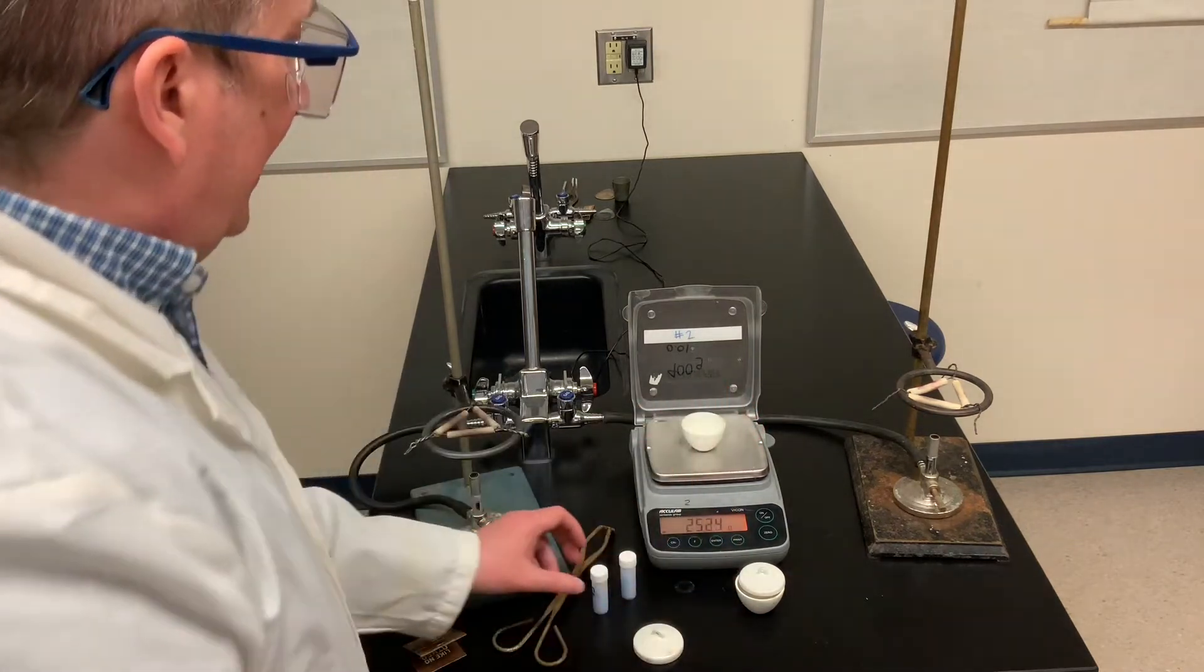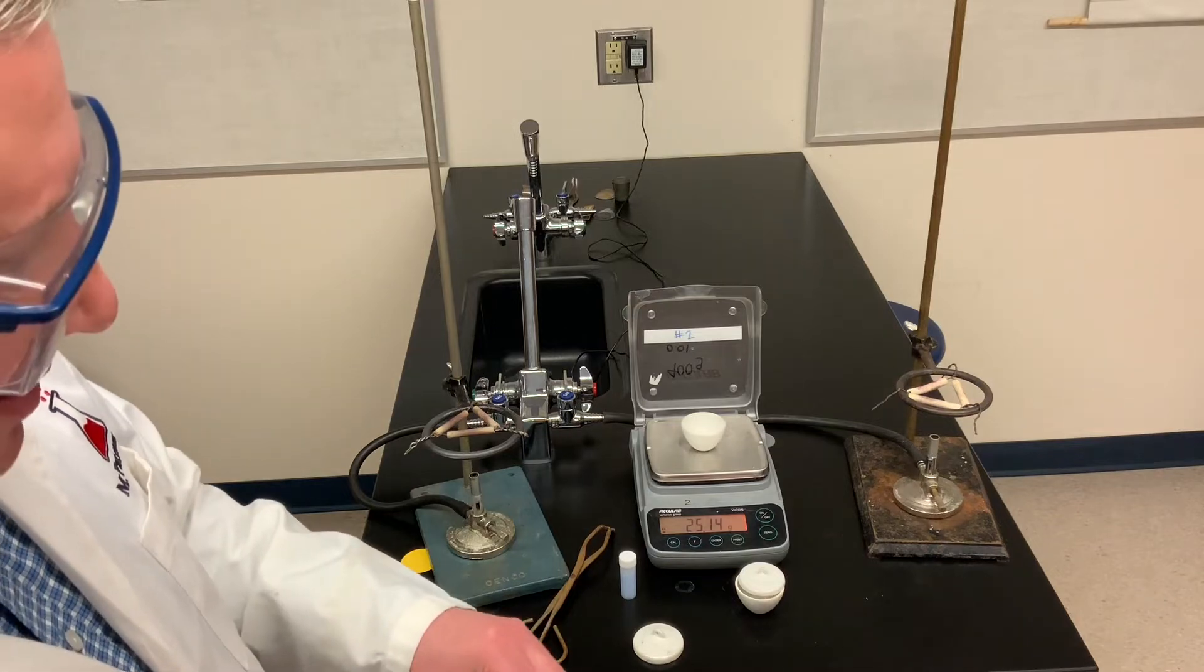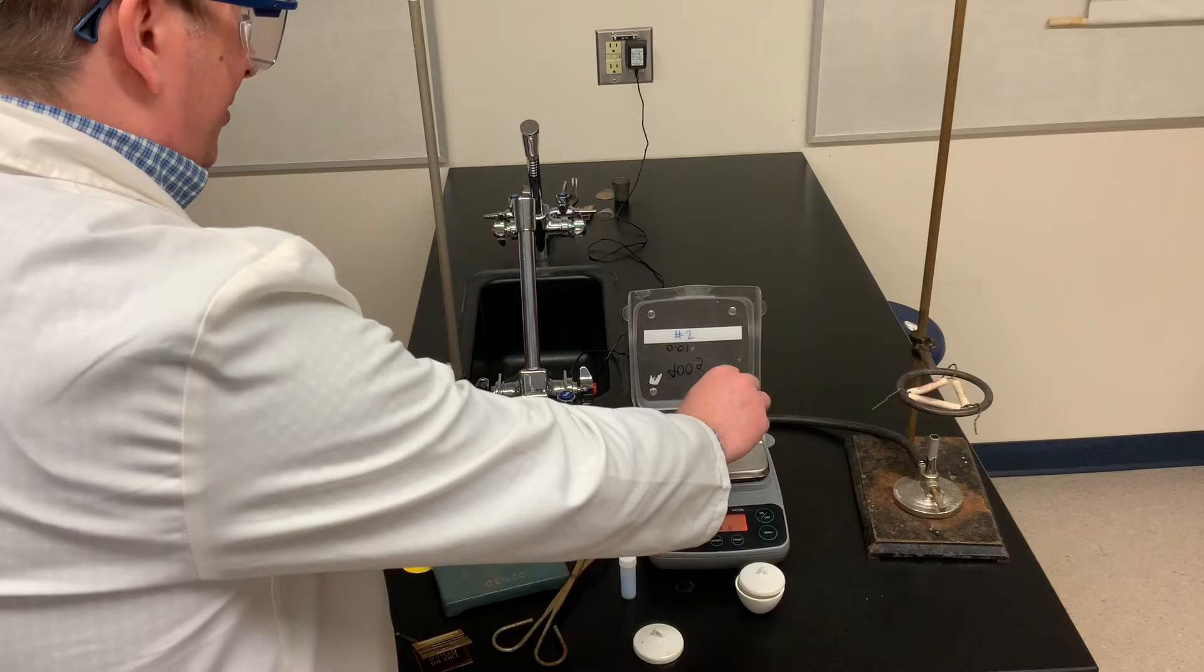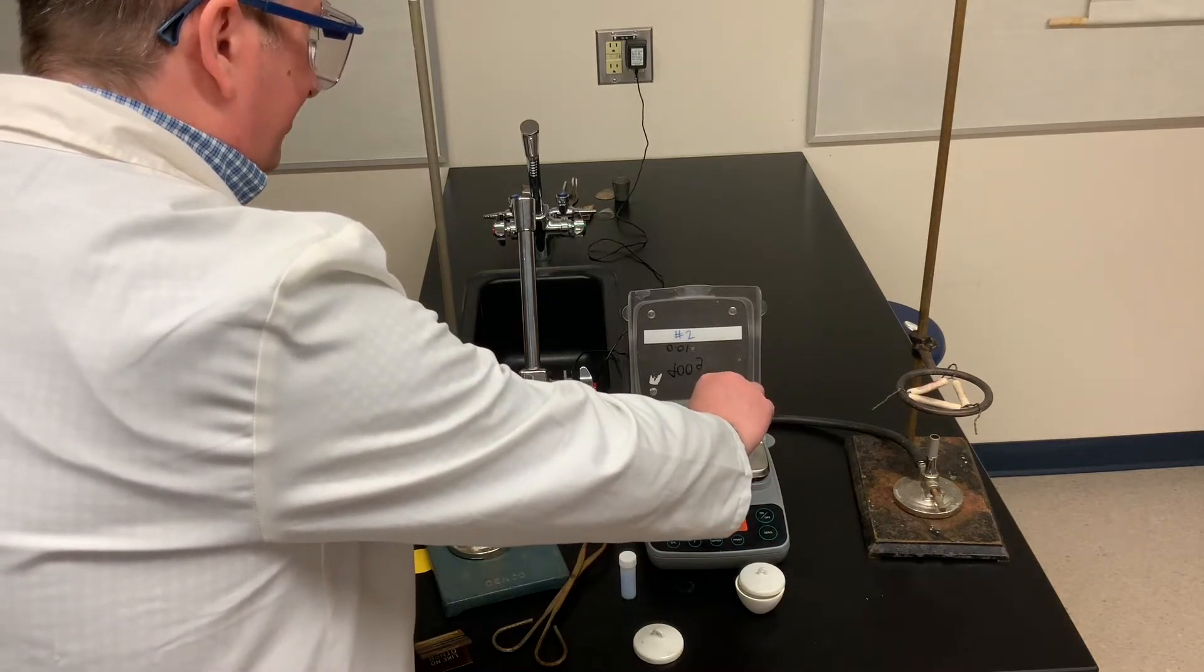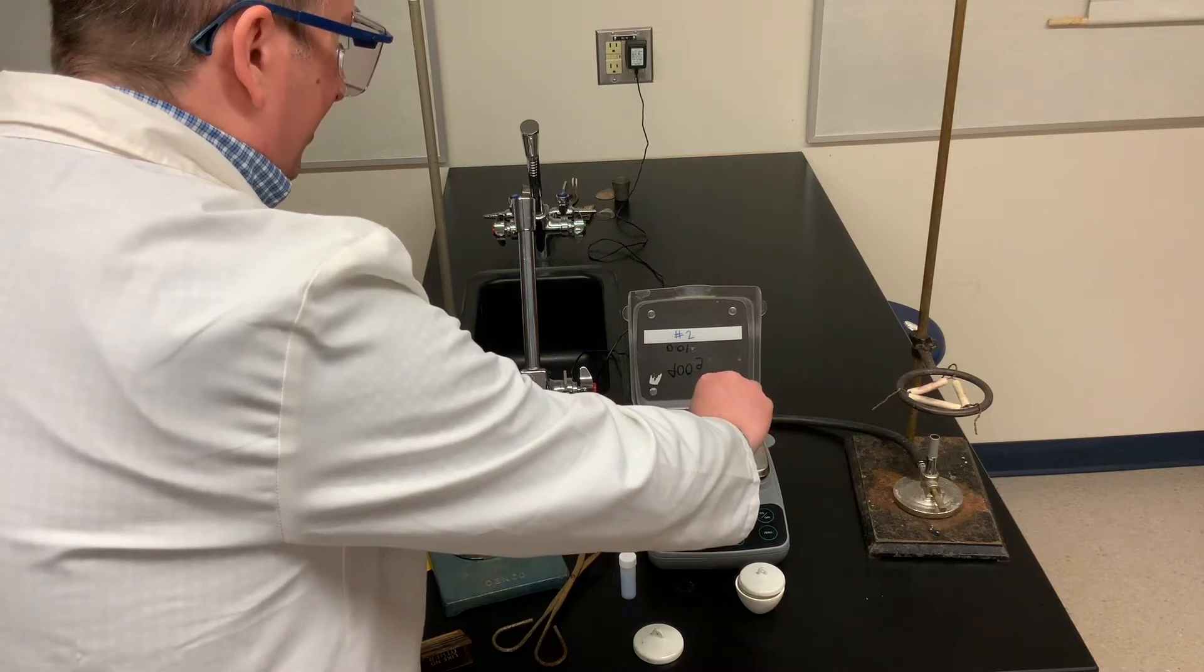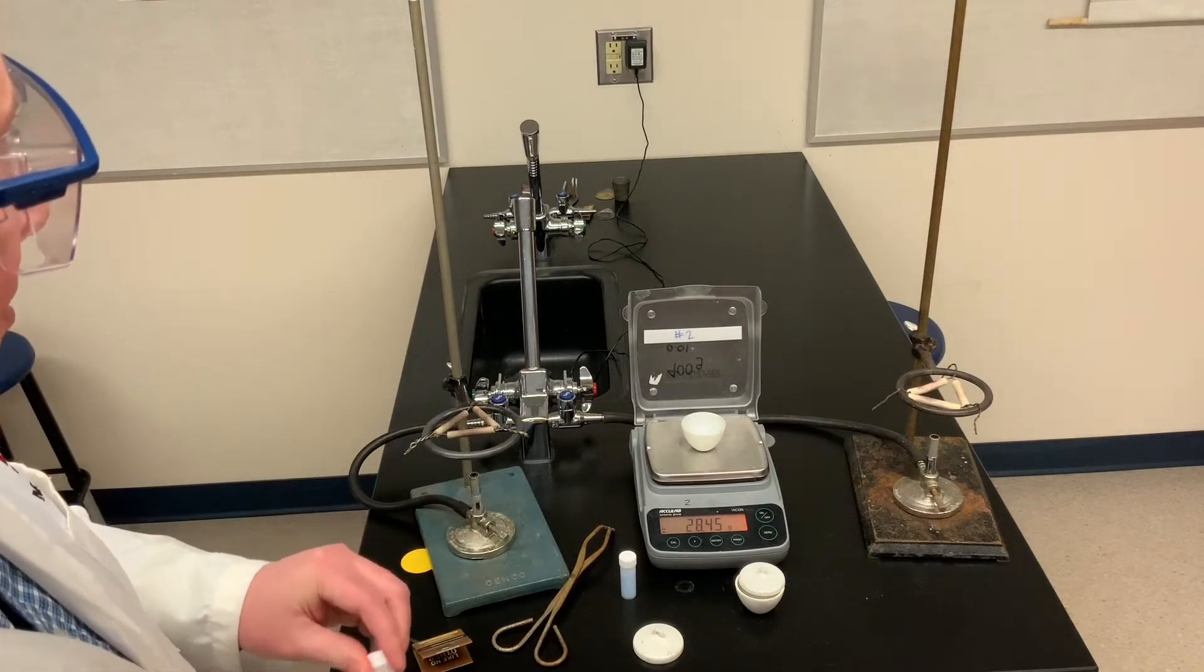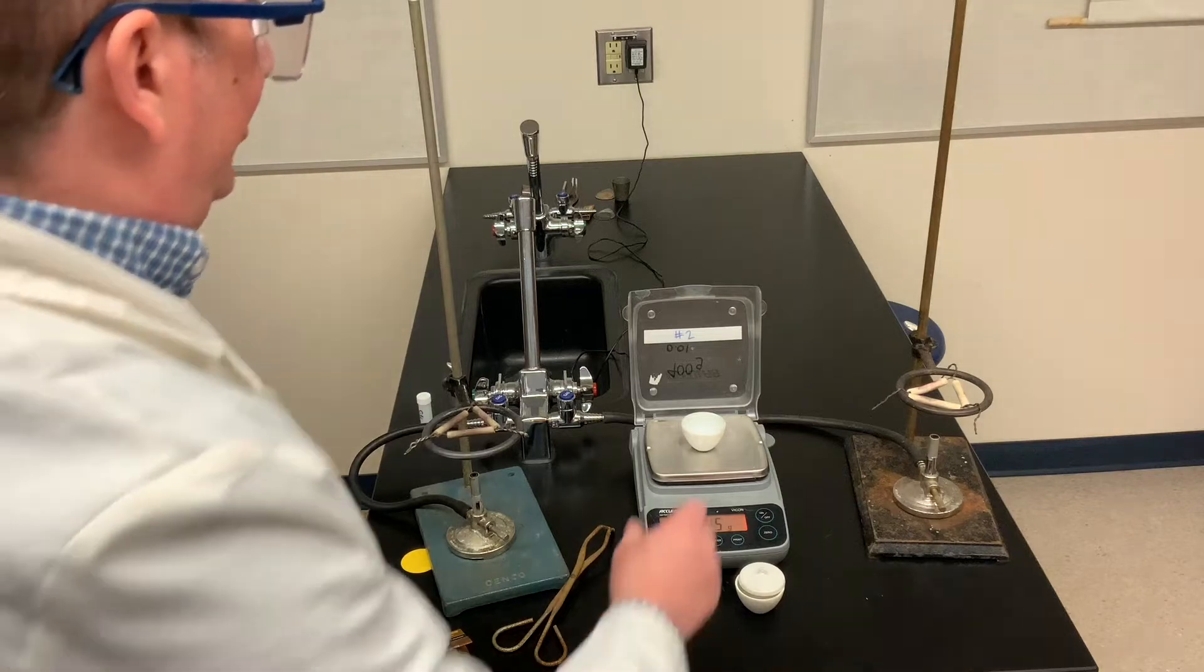So you can record the mass of the first crucible. Now I'm going to take some of my copper sulfate salt. I'm going to add that to the crucible and you're going to record the mass of the salt after I've added it. So you want to record that mass of the crucible with the hydrated salt.